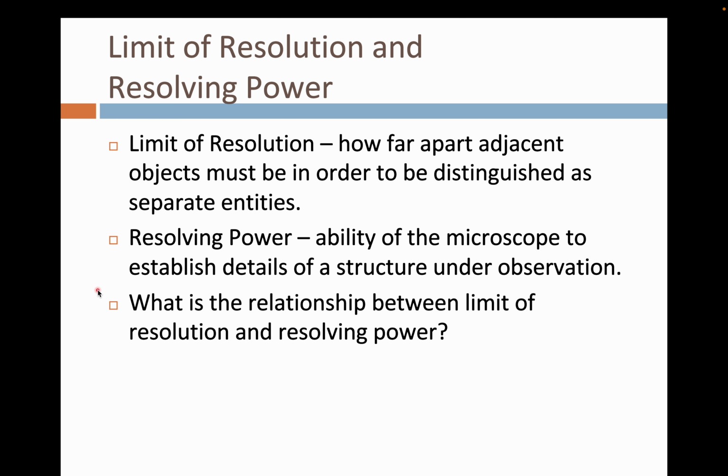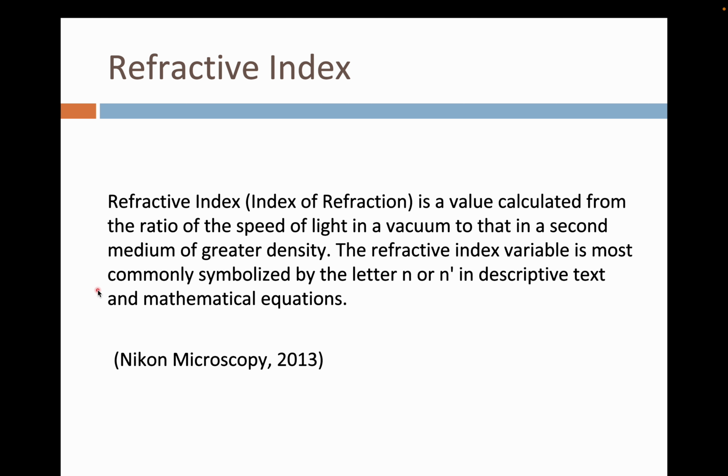So I won't answer this question yet because it's not the post lab yet. So please think about this question. What's the numerical relationship between the limit of resolution and the resolving power of your microscope or your objectives?